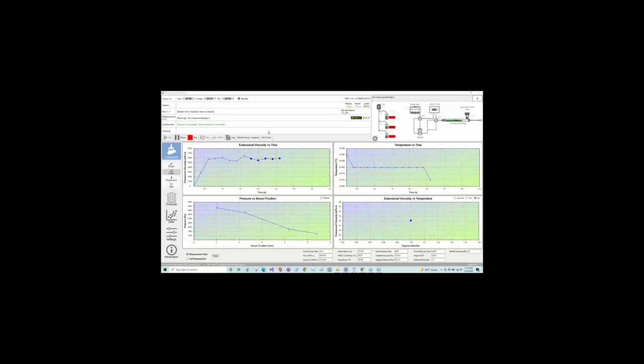So now what we see is data coming up here, and you can see immediately we don't have the same type of pressure drop across the flow channel that we would otherwise. So you can see there's a more significant decrease across the central zone. However, much of the other results look very similar. Basically, we're looking for a transient to plateau out and have a nice plateau so that we can average the data over that plateau.